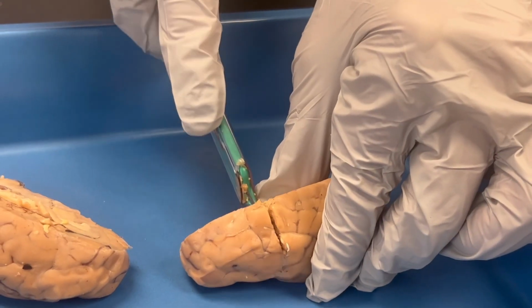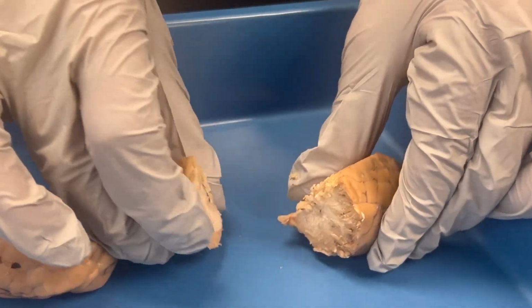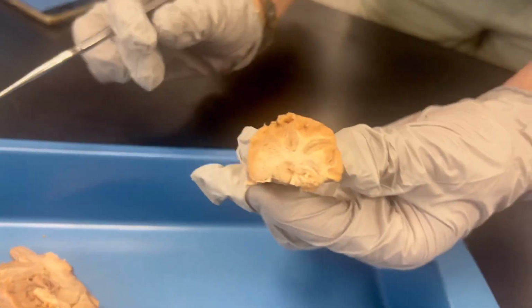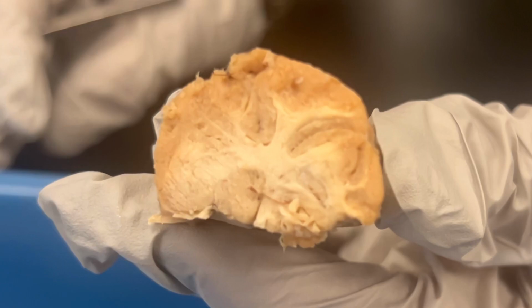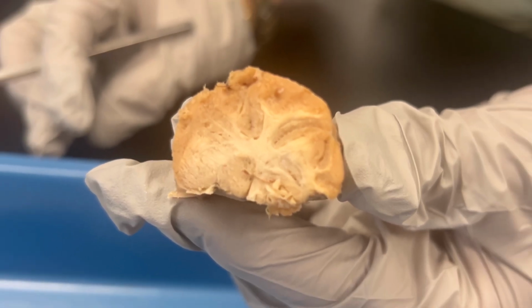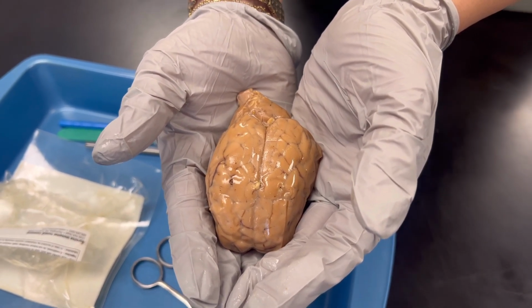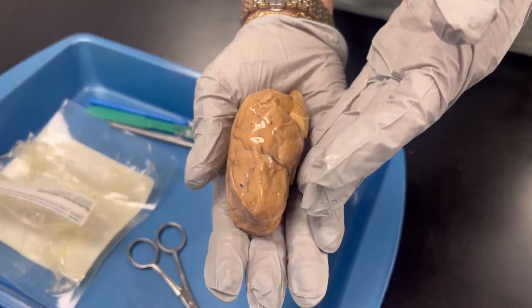Lastly, we are now going to cut the cerebral hemisphere in the frontal plane, or simply front and back. Here, we can look closely at the gray matter, the cerebral cortex, and also the white matter. And just like that, we are done. You and I successfully dissected a sheep's brain.